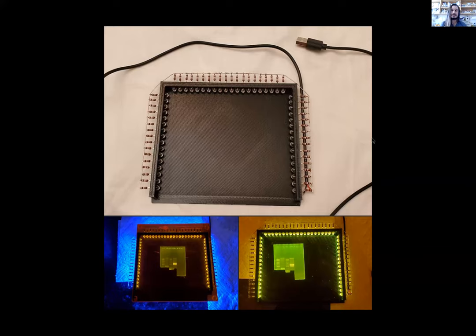The catch is you excite it with blue light and then it emits green light. So you need something that allows you to pass the higher wavelengths, a high pass filter. And it turns out that there's this particular acrylic called 2422 amber acrylic that is the best blue blocker for this. And this is actually what folks like the miniPCR people do.